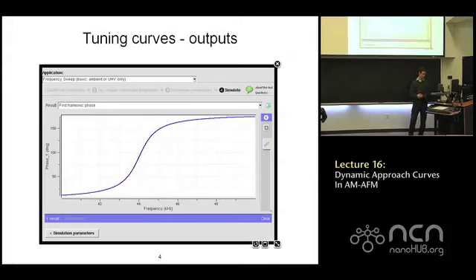Also, in the experiment, when you do this curve, probably you're going to have a delay because of the response of the dither piezo you apply the voltage to, and possibly some phase lag in the electronics. But you can calibrate that knowing that around the peak, it should be at 90 degrees. So you probably shift the phase when you do the tuning curve.